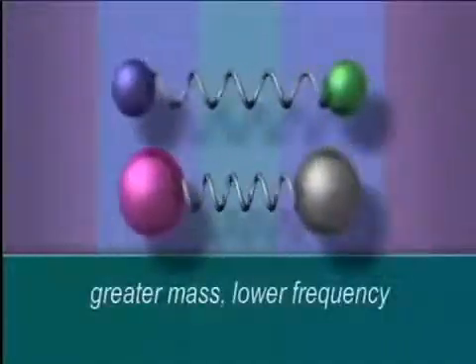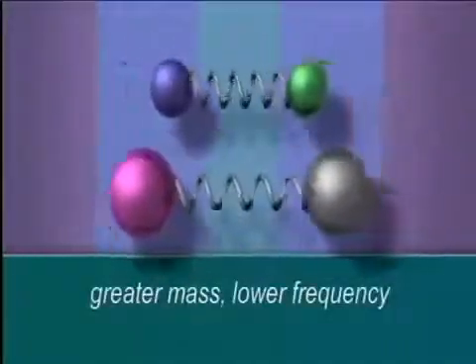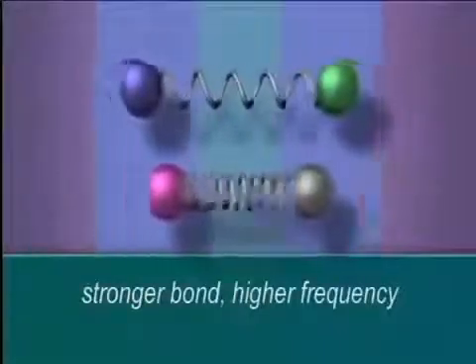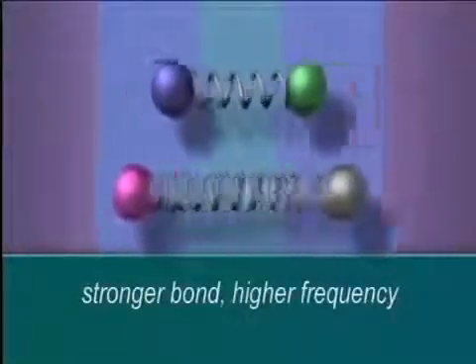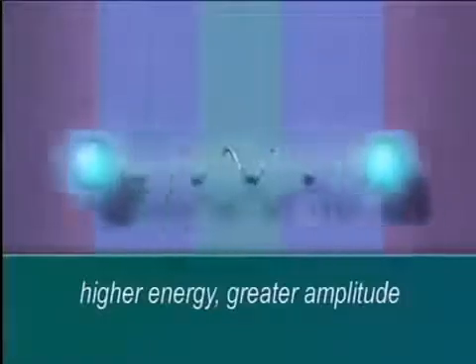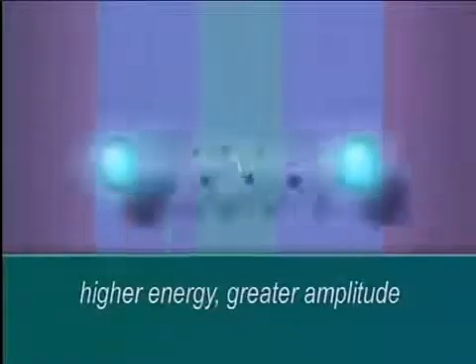Lighter atoms give higher frequencies. Heavier atoms move more slowly and so give lower frequencies. Stronger bonds give higher frequencies, and weaker bonds, lower ones. At room temperature, most bonds will vibrate with the lowest possible amount of energy. But if radiation of the right frequency is supplied, the bond can absorb energy and vibrate with greater amplitude. Most bonds absorb energy in the infrared region of the electromagnetic spectrum, which corresponds to heat.